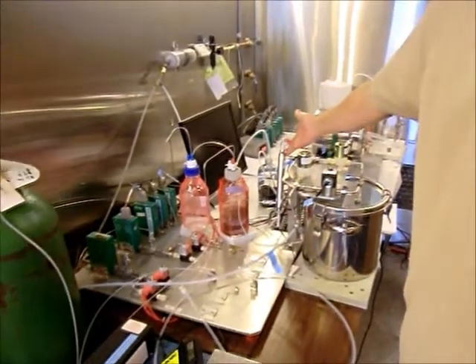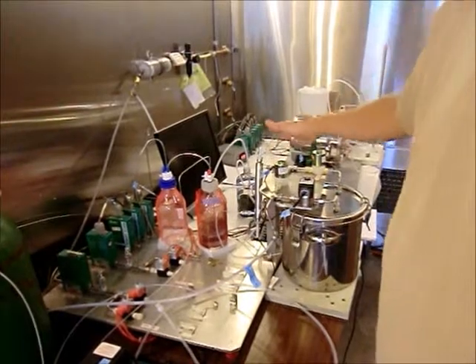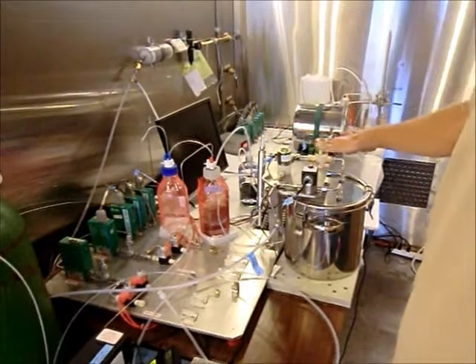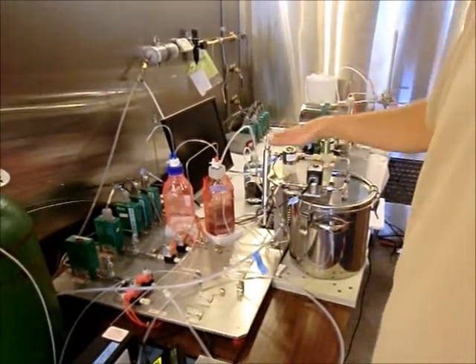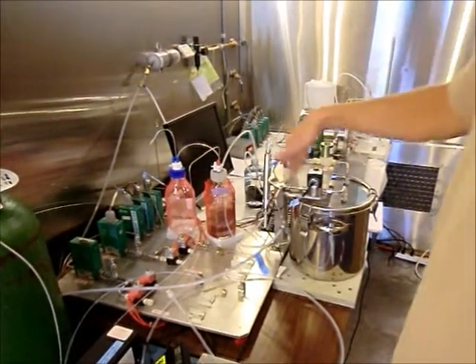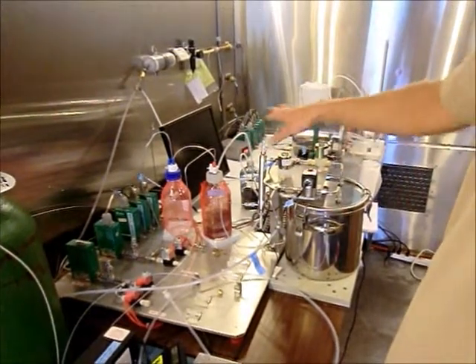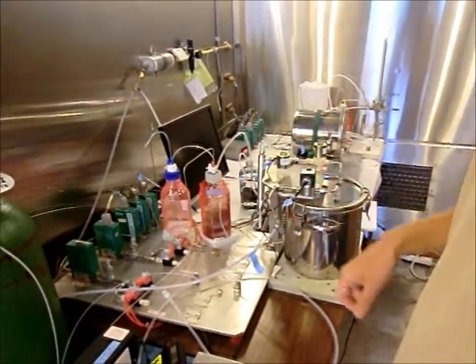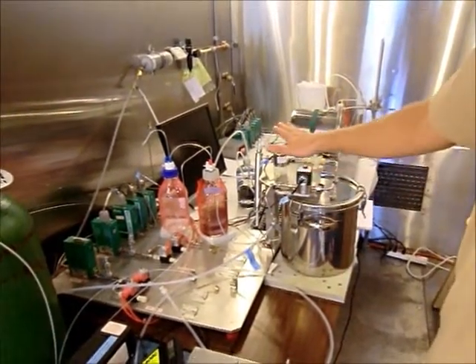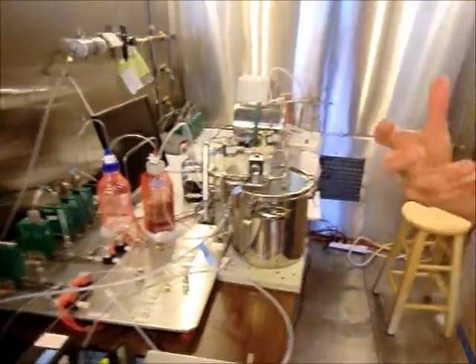This is an ultraviolet light ozone generator, and in combination, by adding water and ozone, we can get just the right conditions. These valves at the top are used to adjust whether we are measuring the upstream or downstream ozone concentration flowing through this reactor. We can use that information along with some other information about the system to calculate our deposition velocity at a given time. Okay, so now we're going to have Melissa, one of my students, come over and walk through how an experiment is set up.